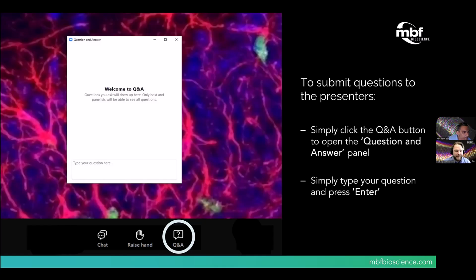I can comment on the sample fluorescence. In the context of how much light you want to use, what I typically do to determine how much light I can use is I'll slowly increase the amount of light until I reach a point where I'm slowly photobleaching the sample. Every fluorophore is slightly different.